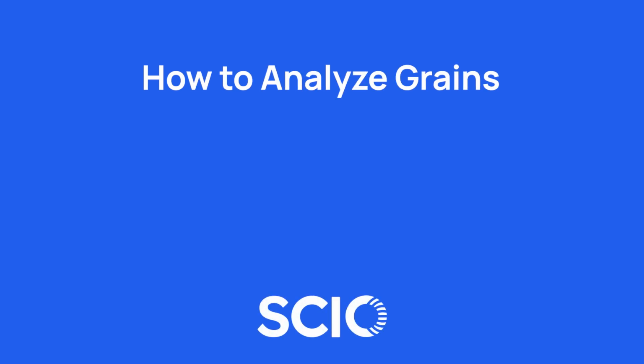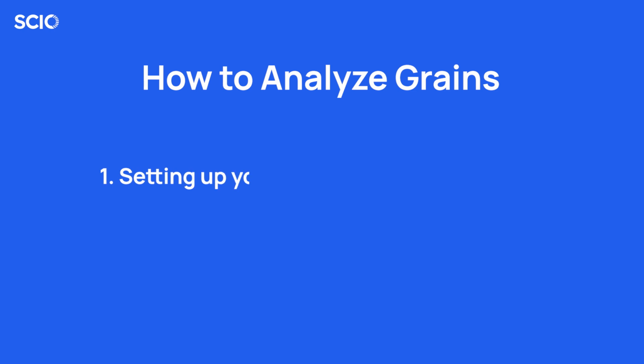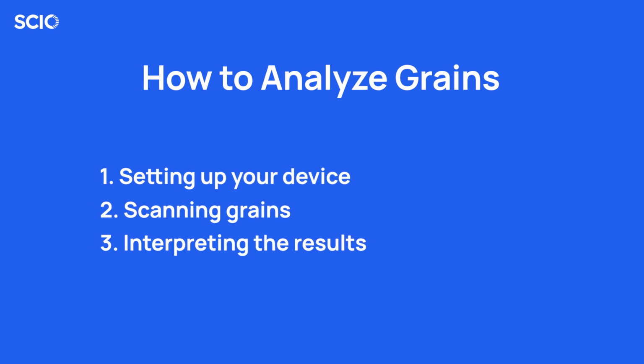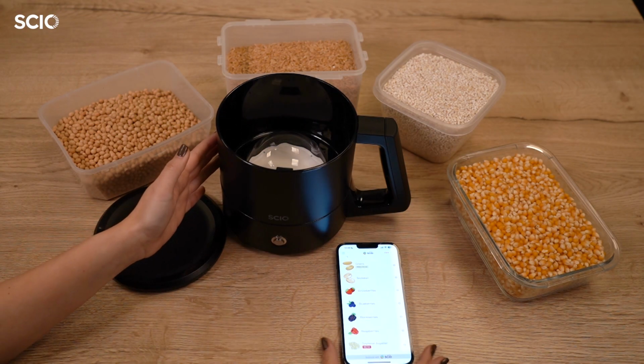Welcome to this tutorial on using the SCIO Cup for grain analysis. In this video, we'll guide you through setting up your device, scanning grains, and interpreting the results to make informed decisions. Before we start, ensure you have your SCIO Cup, the SCIO mobile app, and a grain sample.